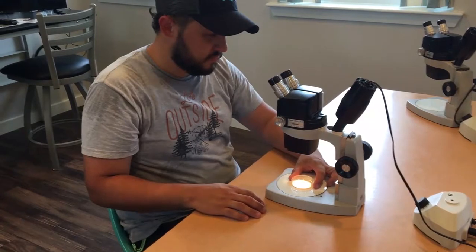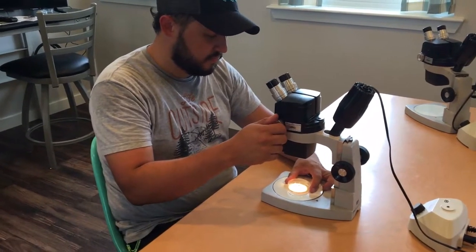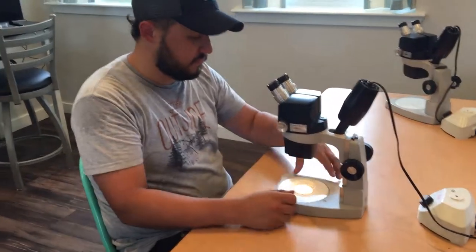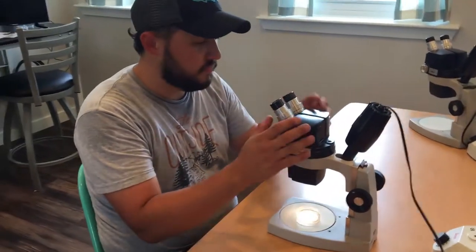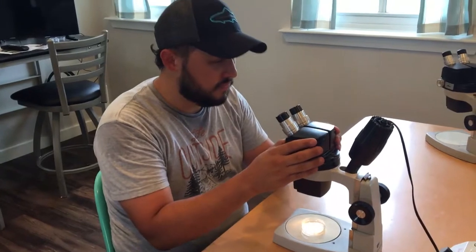Our first job is to adjust the eyepieces. Each of us have a unique distance between our eyes, so to see clearly through the scope with both eyes at the same time, we'll need to start by adjusting our eyepieces or oculars to match our personal eye width.